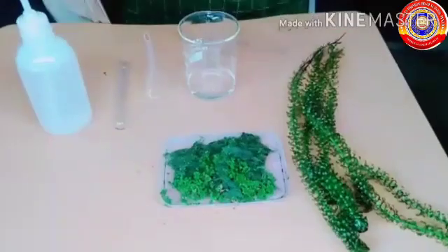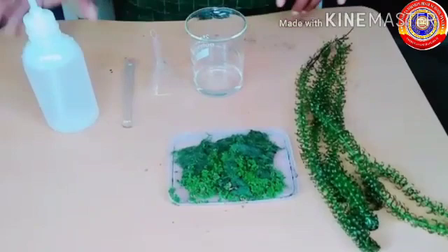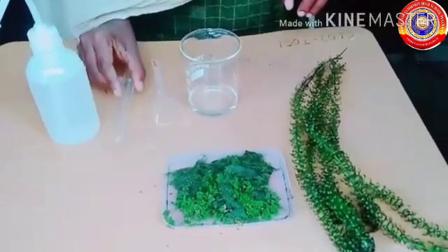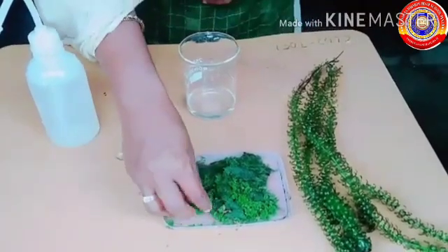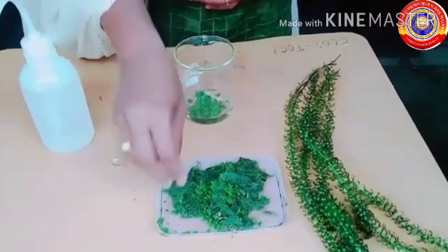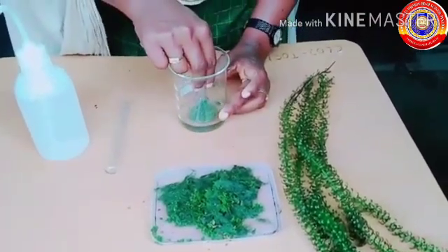Materials required for the experiment are algae, beaker, bottle filled with water, funnel, test tube. Place some algae inside the beaker. Cover it with a funnel.